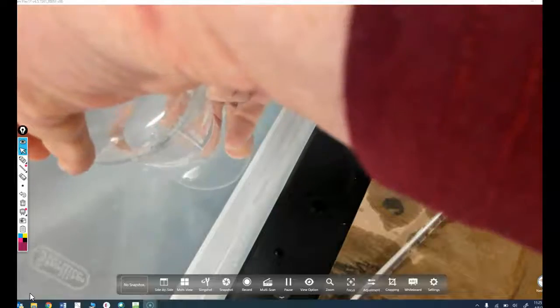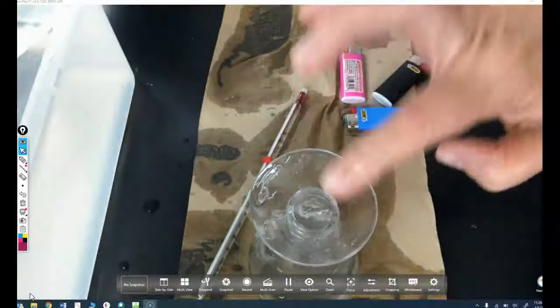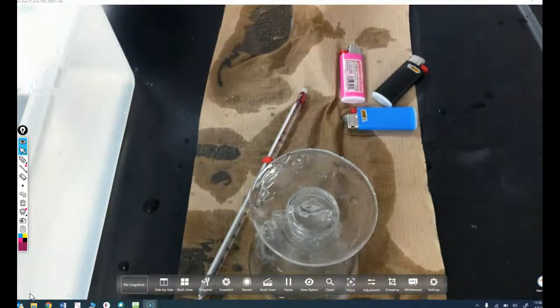I'm placing the glass plate back underneath it, and I'm bringing it out, and I am setting it back at my lab station. So there it all is, following those directions. Hold the plate in place, and I was careful not to spill any water. So we're on number 6.